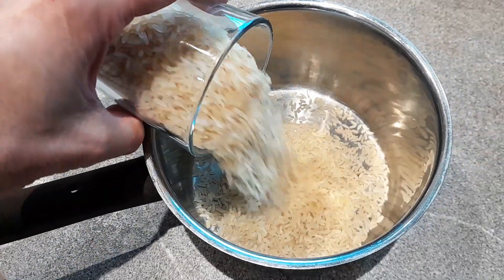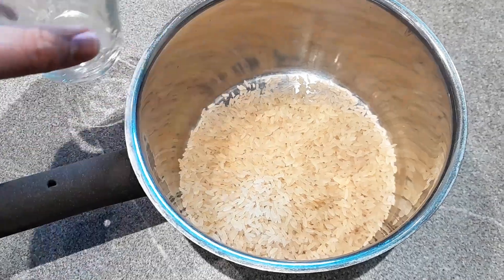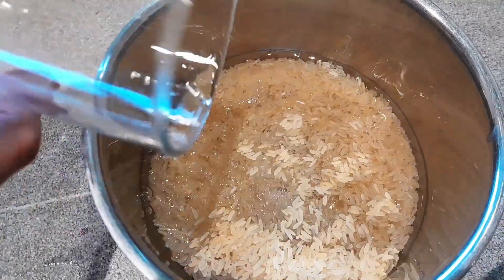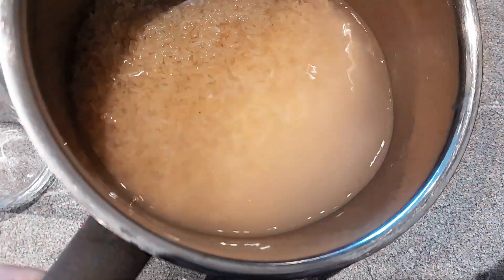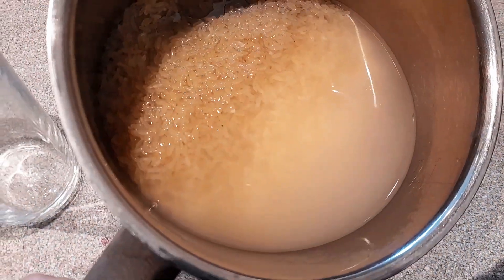Recently, when I made some lunch, I washed the rice to remove the starch. You do that in order to make the rice less sticky after boiling. So this is commonly done. And I decided, why not put a little bit of this white liquid under the microscope.